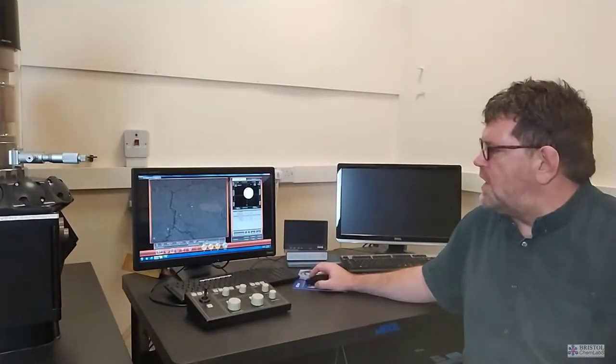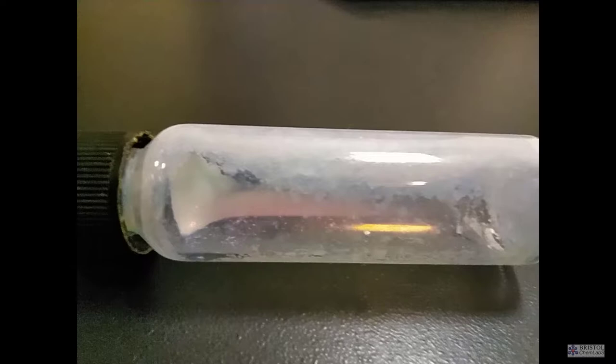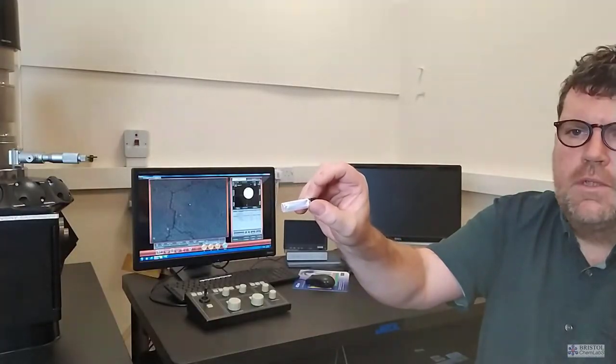These materials are called colloidal crystals. These are interesting because the dimensions of these particles are of the same order as light. At the macroscopic level, the effect you see is that we see white crystalline close packed regions within this glass tube, but you should be able to see the iridescence and color arising from interference patterns as light interacts with these well-ordered features. These colloidal crystals are synthetic versions of opal. The natural mineral opal, if you look at it under a scanning electron microscope, will look exactly like this in terms of being composed of close packed silica spheres.